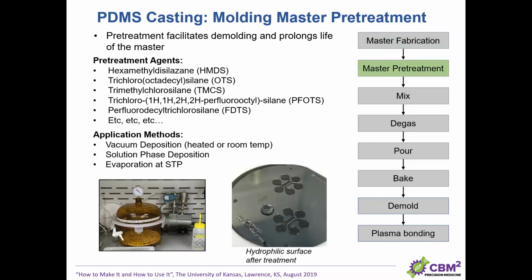The nice thing is that the production of the master is probably the most expensive part, but you can, for example, have it done by an external company or your colleague at a different institution. And then once you have the master, everything can be done literally on 4 square feet in your corner of the lab, right?